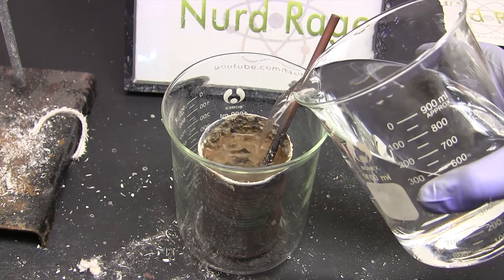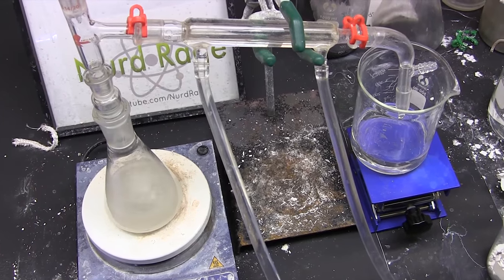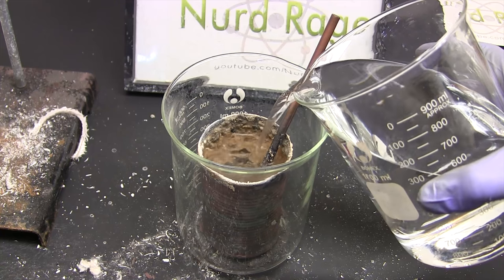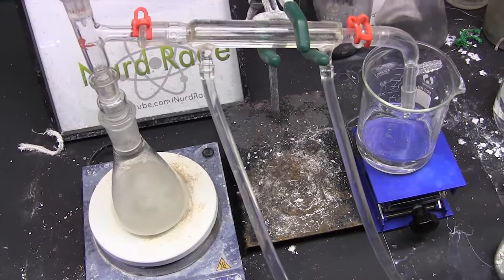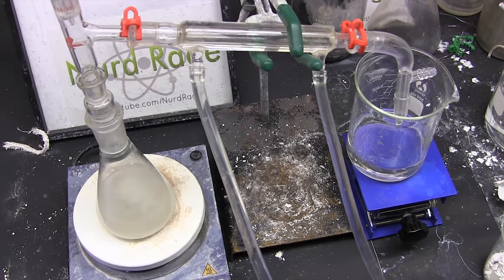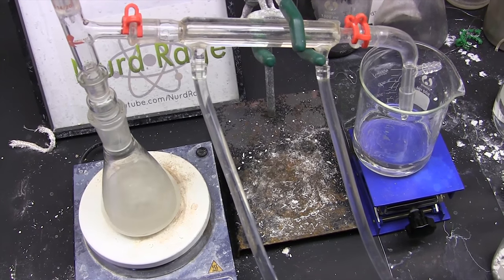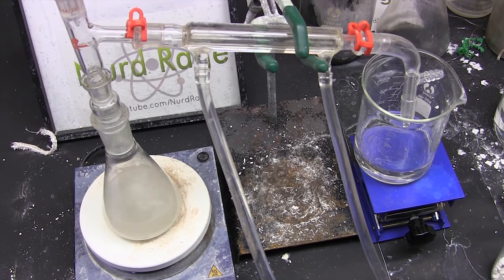One thing you could do is treat your mixture with the solvent, filter it off, then distill the filtrate so you have fresh solvent again and retain the recovered chemical. Now you add your solvent back to the residue and dissolve more of the chemicals, filter again and then distill again. If the process is repeated enough times, you can recycle the same quantity of solvent over and over again and completely carry out a weakly soluble chemical this way. The problem is that distillations are slow, and if you need to do this 1,000 times, then you can be at this for days, even months.